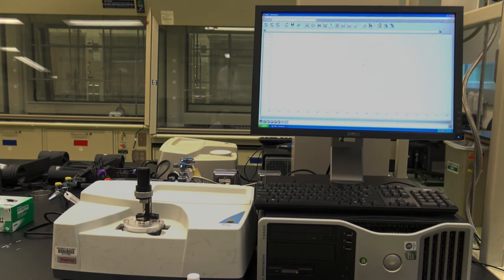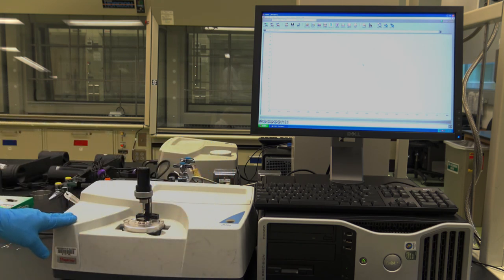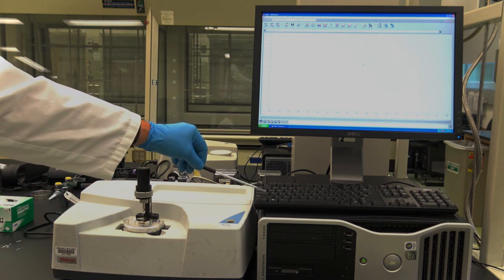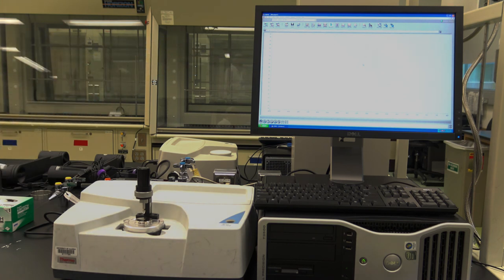I've now taken my sample over to the infrared spectrometer. Here we have the infrared spectrometer with an ATR attachment, attenuated total reflectance. Over on my right-hand side here is the computer controlling that, and I've brought up the infrared spectrometer software. The first thing we're going to do is collect a background spectrum so we can subtract that off from our sample spectrum. The reason we take a background spectrum is because there are gases in the air, there's water in the air, which also have infrared transitions, so we must subtract those off.